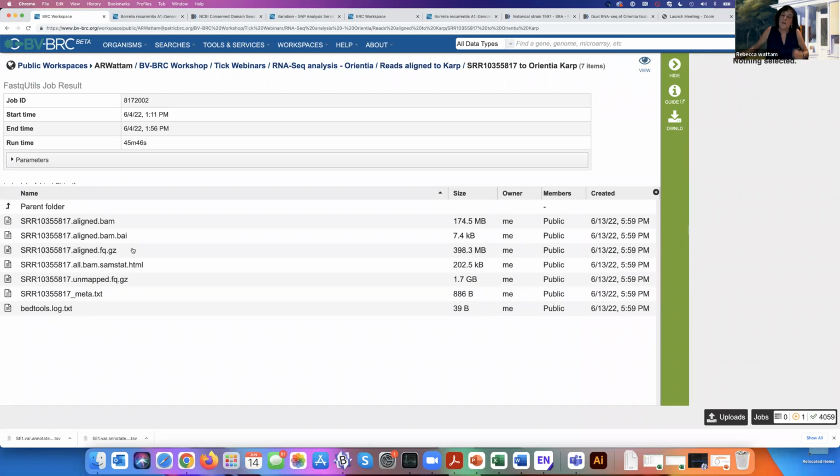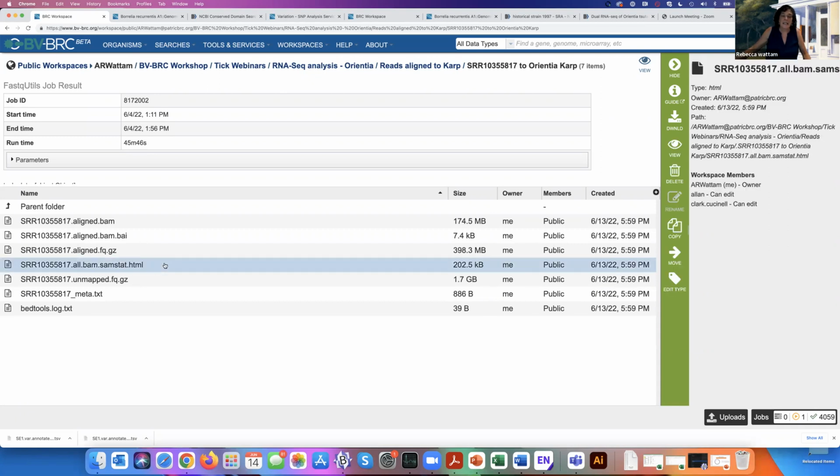These reads I'm going to use in the bacteria versus bacteria analysis. These reads I'm going to use in the host response to the two different bacteria. So these should be to the human genome, these are to the bacterial genome. And this just is going to give me an indication of how many reads there were.